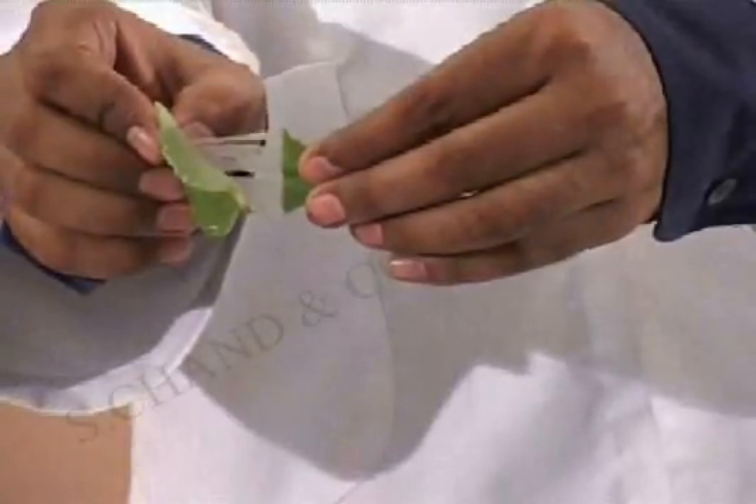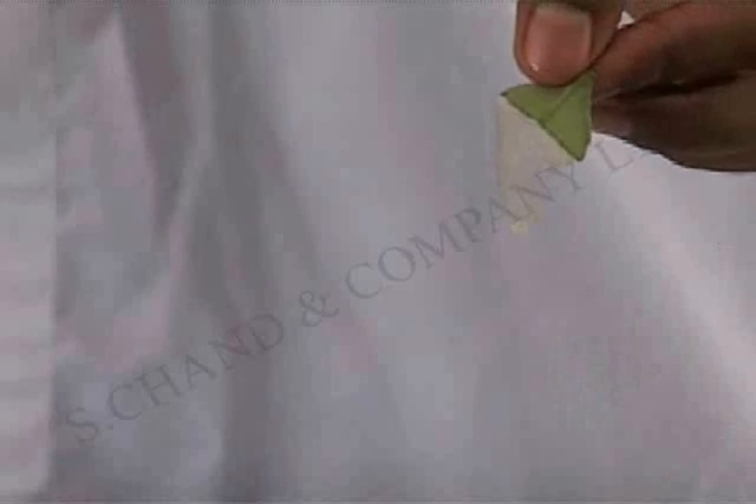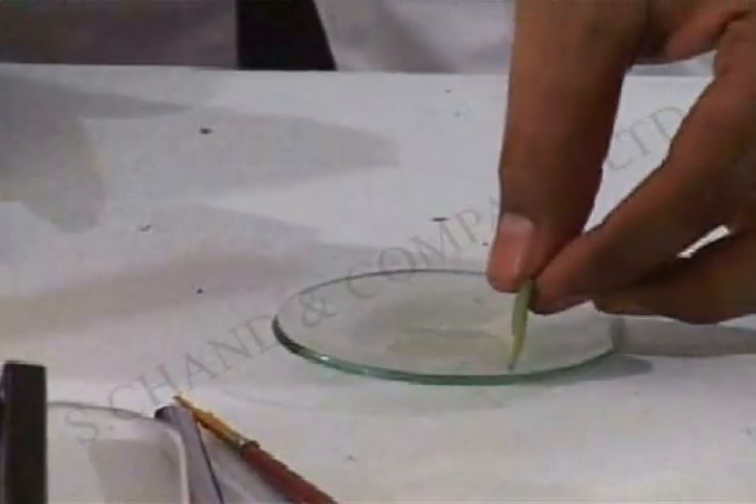As you can see, this is the peel that we are looking for. What is visible to you is a leaf peel. I am going to put it on this watch glass — we already have about 4 or 5 drops of water on this. I am going to cut it using this blade here.